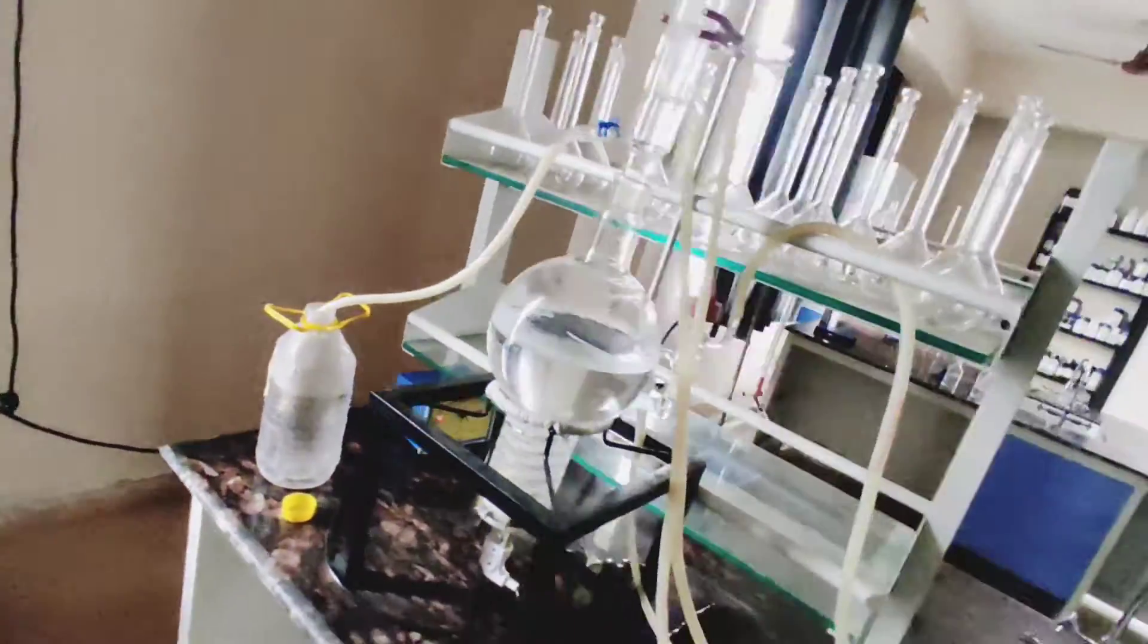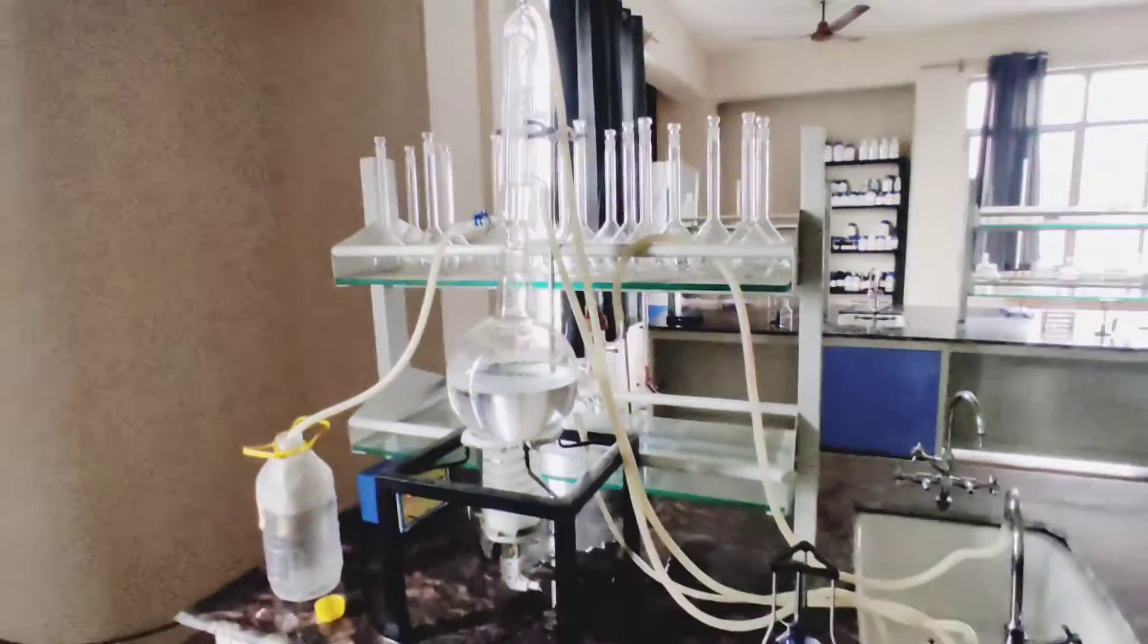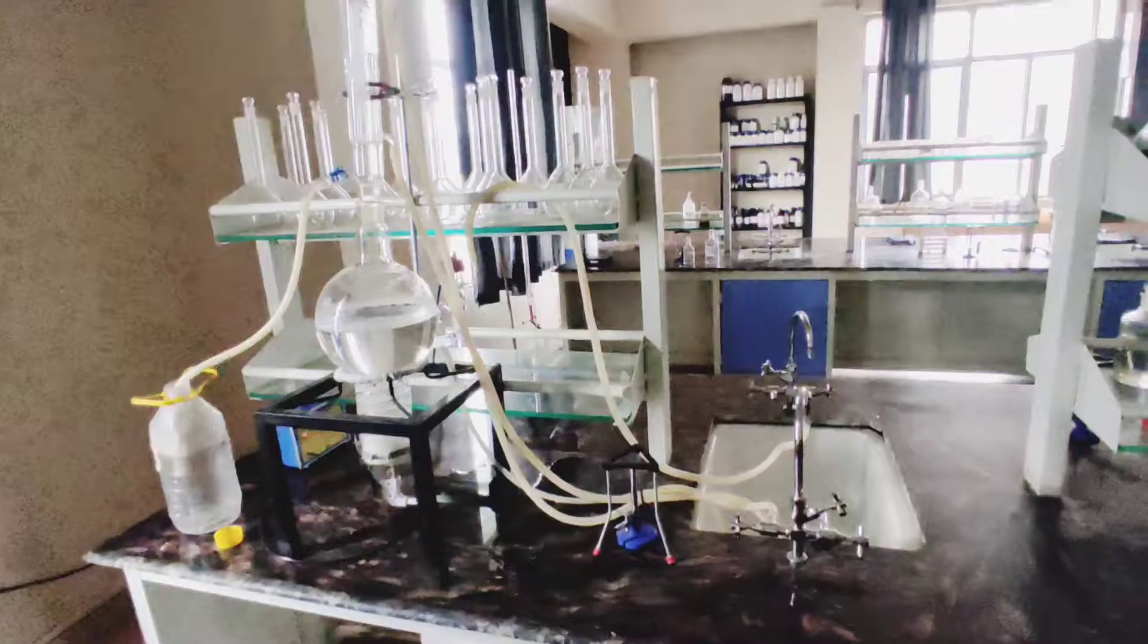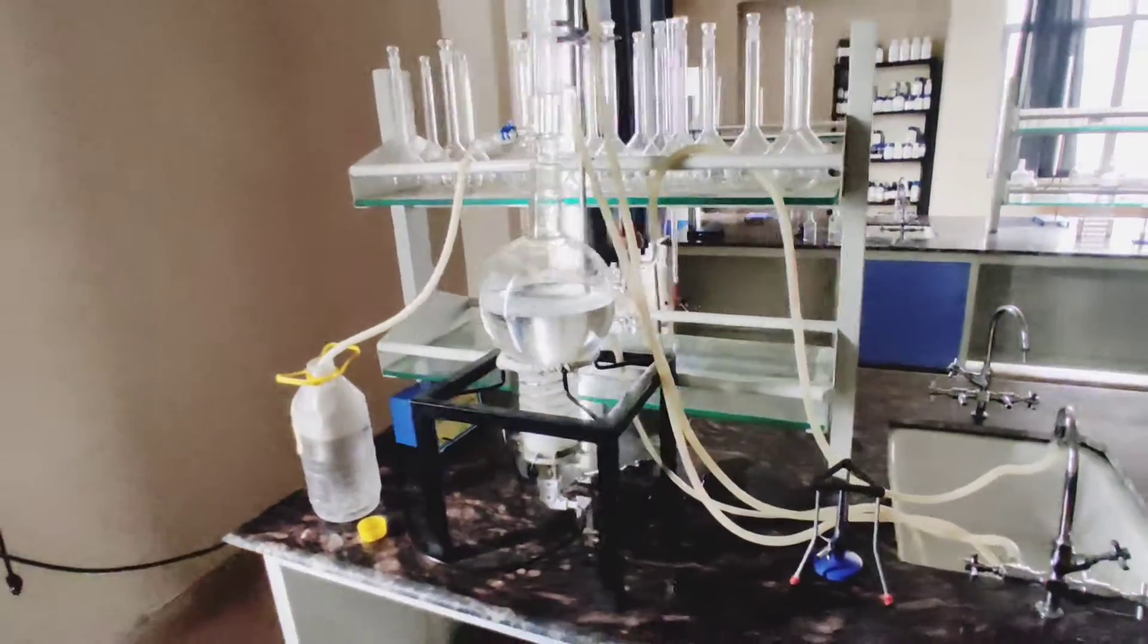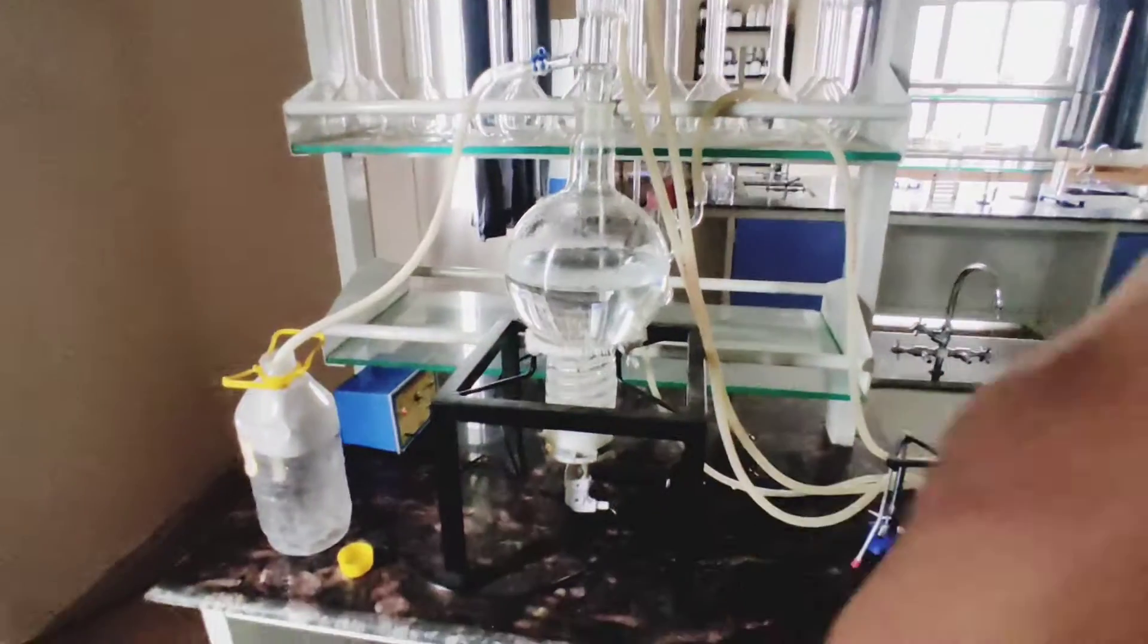So this is the distillation process, this is the whole unit and this is the soil science lab. Here you have to see the distillation chamber. I hope this explained the distillation unit.